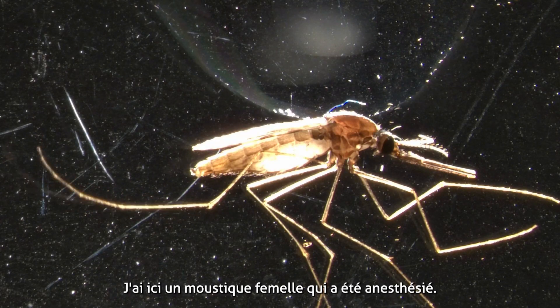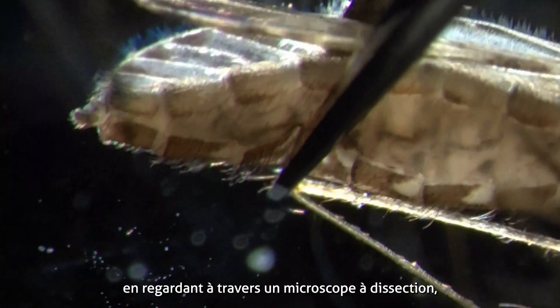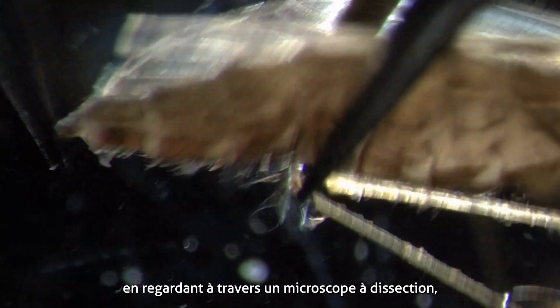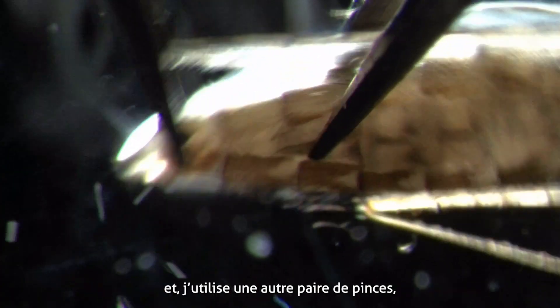Here I have a female mosquito that has been anesthetized. To remove the spermatheca, as I am looking through a dissecting scope, I anchor the body of the mosquito with one pair of fine forceps and use another pair of forceps to gently pull the last segment of the body to tear it from the body.